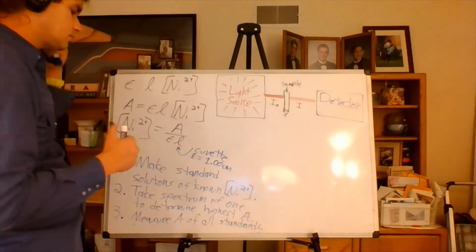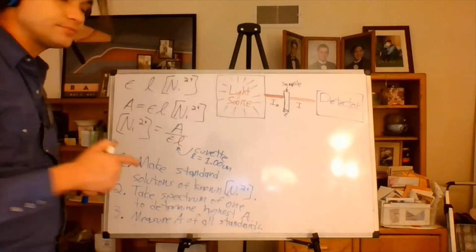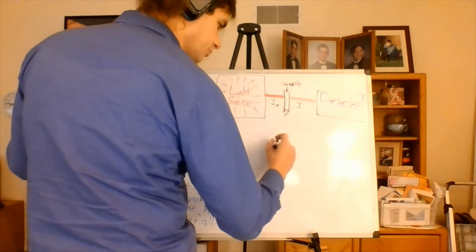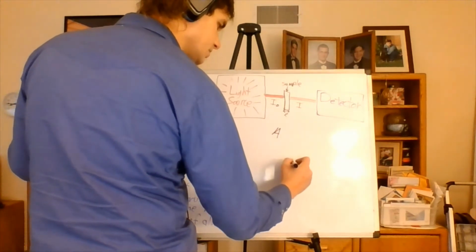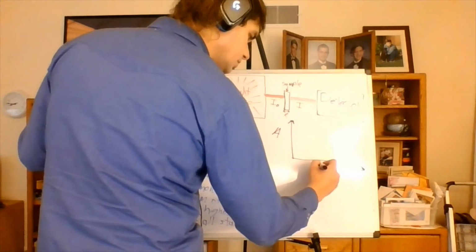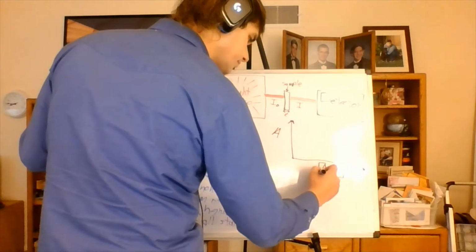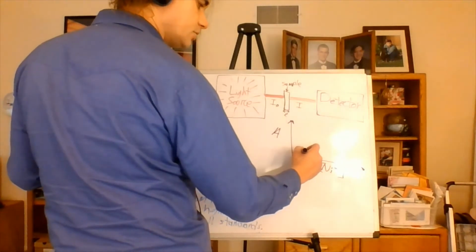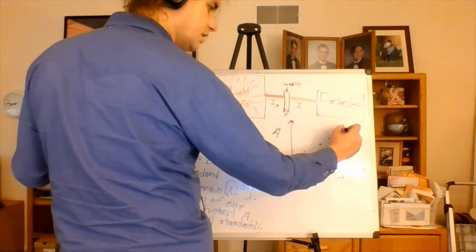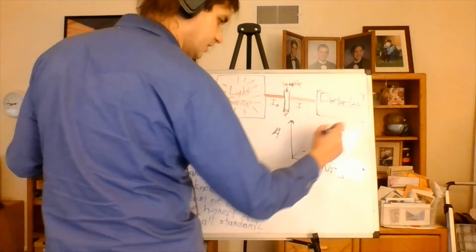So this Beer's law, if it indeed holds, and it does, should give us, we plot absorbance here versus concentration of our standard, that should give us a fairly straight line. Actually, hypothetically, it should give us a perfectly straight line.